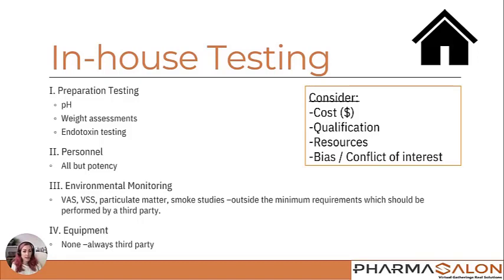You probably also do weight assessments. I think what comes to mind most often with that is weighing your capsules at the end of a batch to make sure they've been filled in a uniform way. And you could potentially do endotoxin testing in-house. There are some great machines out there that make this pretty easy. If you do that, make sure that your technicians are trained and that they have been qualified to use that equipment and that you have validated your preparations on that equipment.